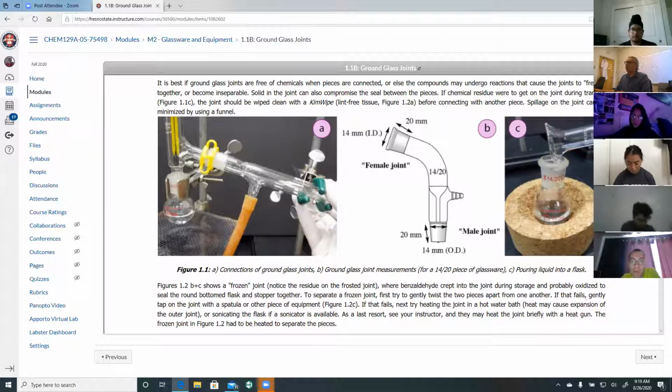Water goes in and water comes out from the other end. I think we talked about it in the past. Water is filling up this outer jacket without touching what's passing through the inside. There are two lines, one line and two lines. The inner line is connected to this flask, to the thermometer, and to the other end. Okay? So the whole idea for the condenser is to pass tap water or cold water. You can actually pass lower temperature water.